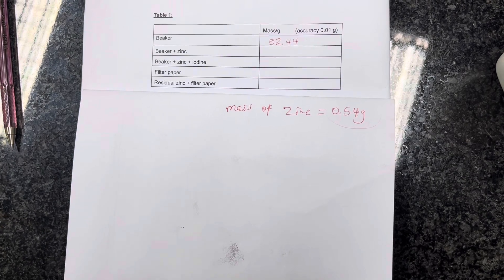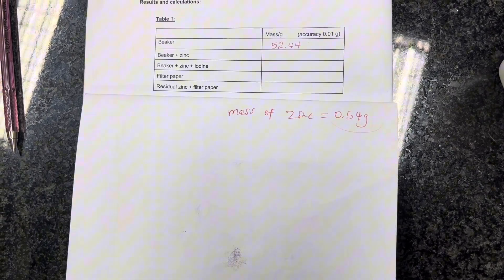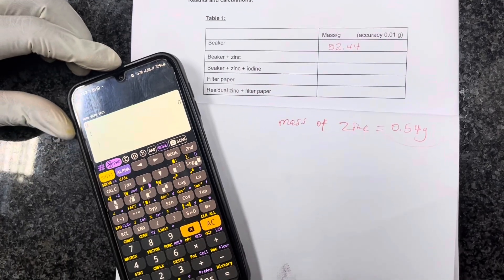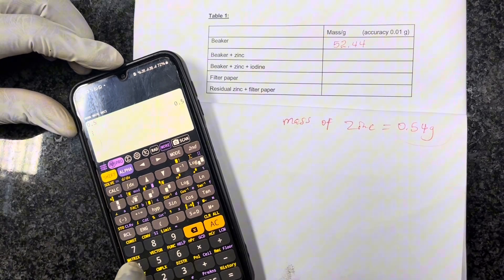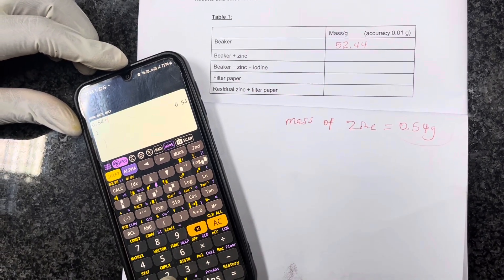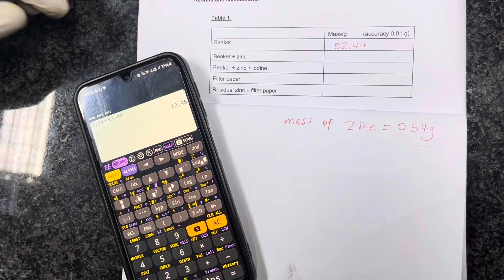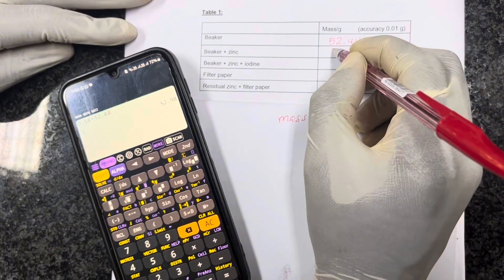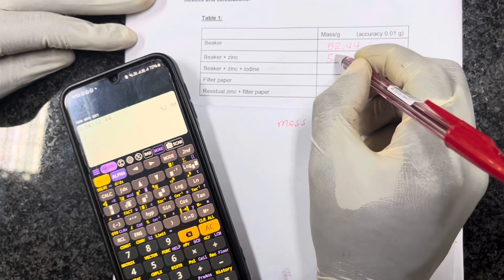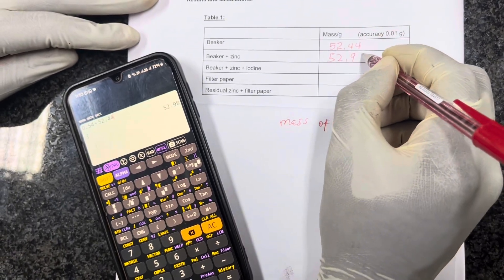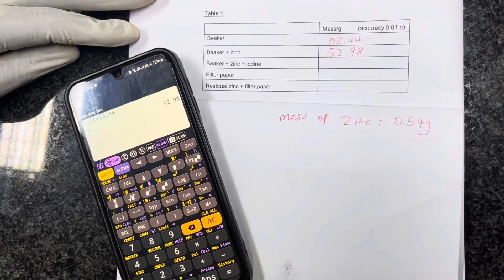So on my table, I have to find the mass of the beaker and zinc. So I just have to take my calculator and add the two masses, the mass of the zinc and also the mass of the beaker. So I'm pressing the calculator here to find that mass and it reads as follows. It's 52.98. That's the mass.